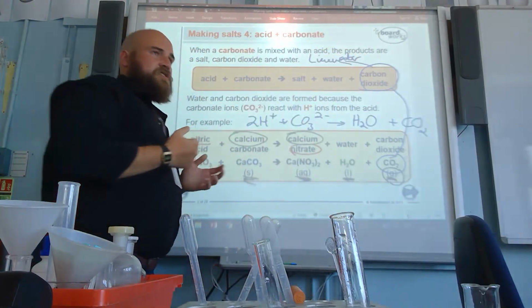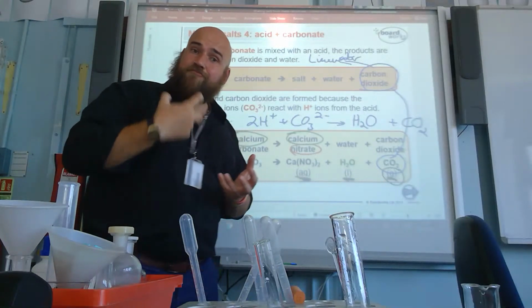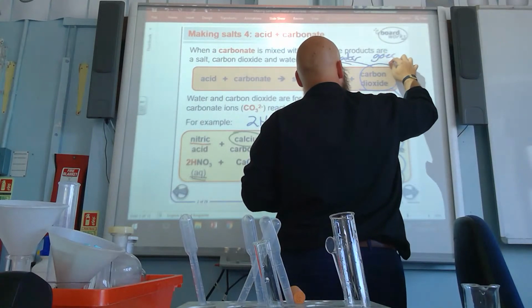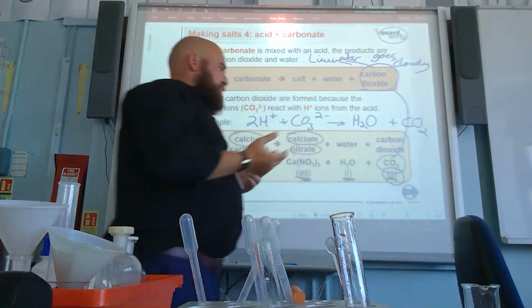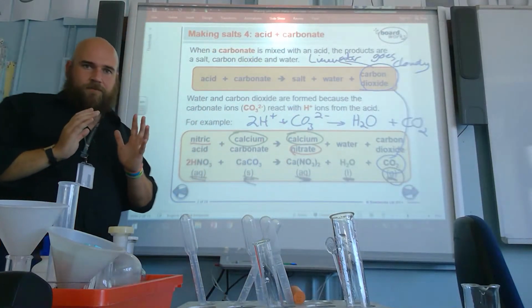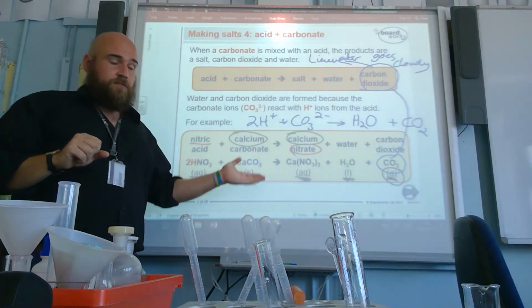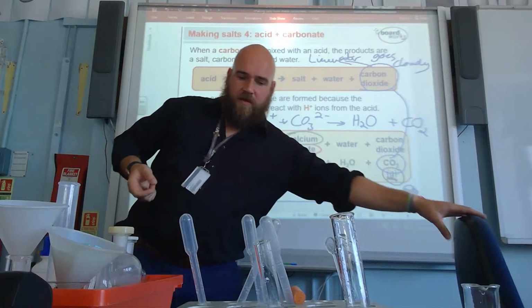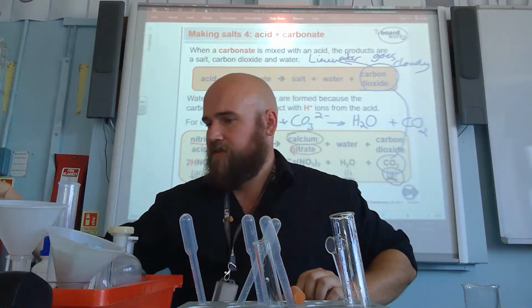And lime water is just calcium hydroxide solution. And lime water, in the presence of carbon dioxide, goes cloudy. So we're going to have to try and prove this now. So I'm going to try this reaction, and hopefully two things will happen. The solid will disappear, we'll get a gas produced, and then we'll test that gas with lime water.